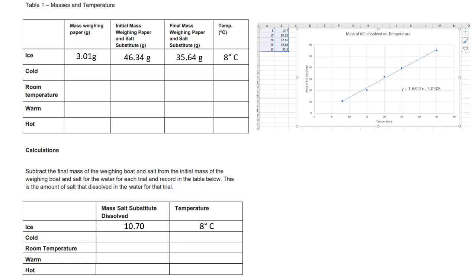This will be the video for the solubility lab. I'm not going to demonstrate that lab because most of it is just dissolving salt into water, which I think you guys can handle as long as you read and follow those directions. But I will discuss what the data will look like and what we want to calculate in order to answer the post lab for the solubility lab.